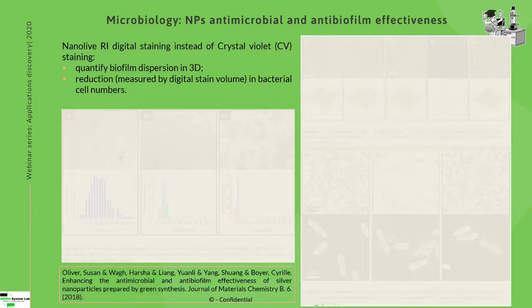We have another webinar dedicated to that. This is normally the approach that you do in transmission electron microscopy. But then the scanning electron microscope can give you the confirmation that those nanoparticles are really in the field of view and they are starting to interact with the bacteria.